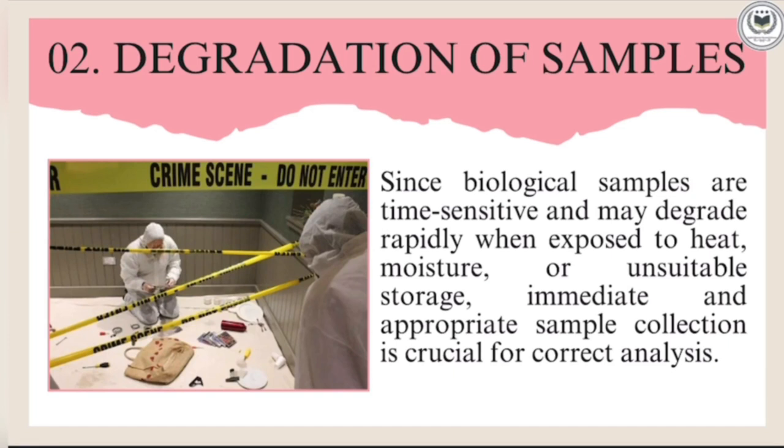Freeze thaw cycles. Repeatedly freezing and thawing biological sample can also cause degradation. This is particularly problematic for proteins and RNA, which are sensitive to temperature fluctuation and can lose their functionality if not handled properly.